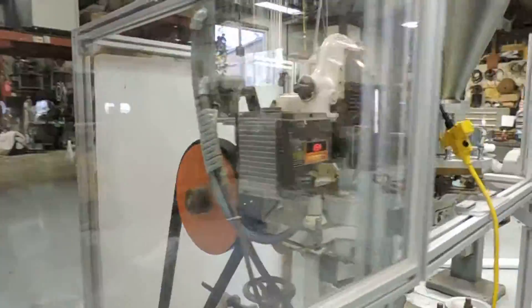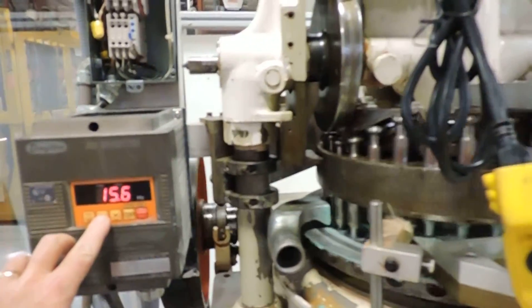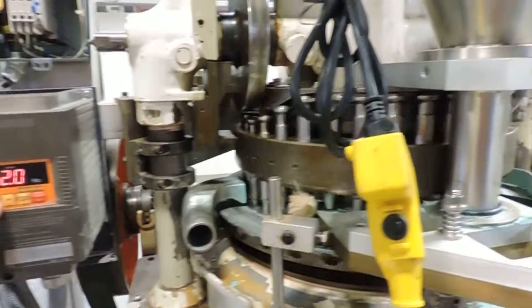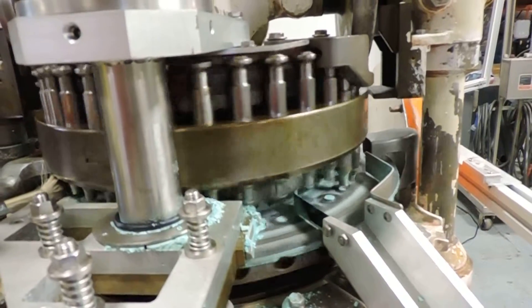The unit is somewhat unique — the former owner has added an inverter speed drive to it to control the speed, as opposed to using the standard variable speed pulley. Because there's no powder in it, the punches are actually touching one another.